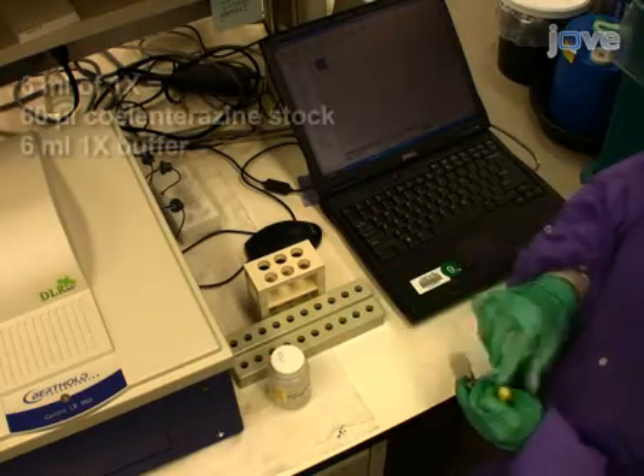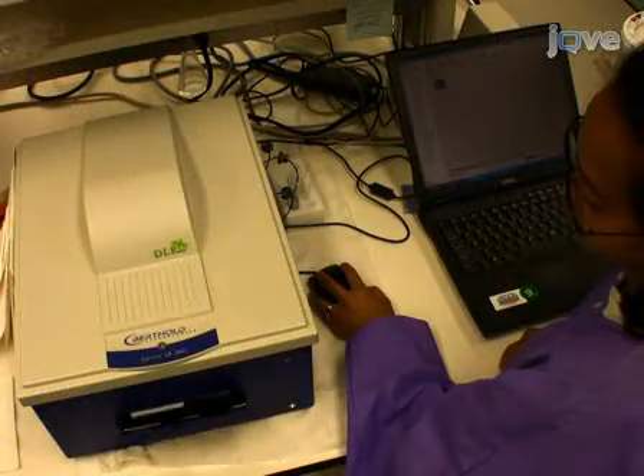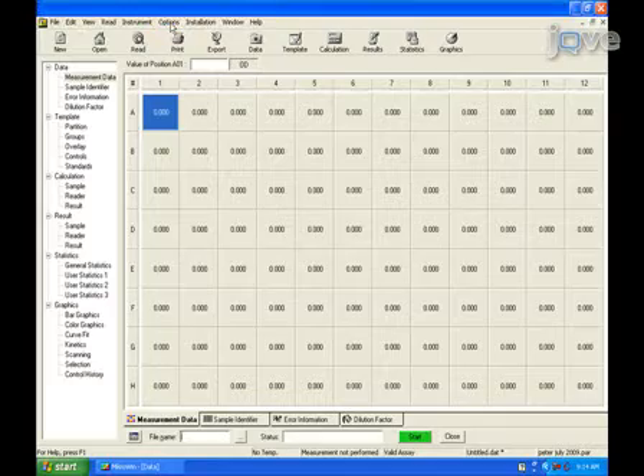Typically, 6 mL of 1x coelenterazine substrate mix is needed for one plate. Load the substrate mixture into the luminometer. Open a program file containing the settings for injecting the substrate and reading the plate.